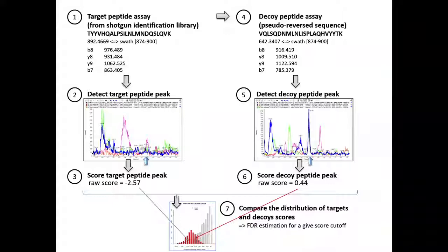I think this might come up a bit with Alexi, because this is a point he likes to talk about: whether in some cases you can retrieve peptides that just look like the thing you were looking for. It will also come up on Friday in the PTM session, because this happens a lot. You have things that look very much like each other but are only slightly different. Then we can implement a second stage of scoring where you look at more fragment ions and try to really verify that the thing you're looking at is what you want, since you may make a mistake with this kind of 6 fragment ion extraction.